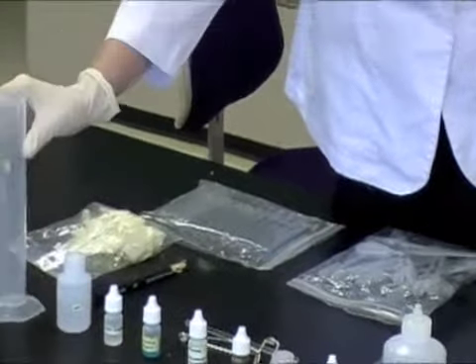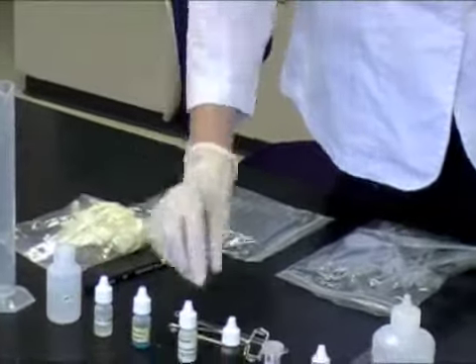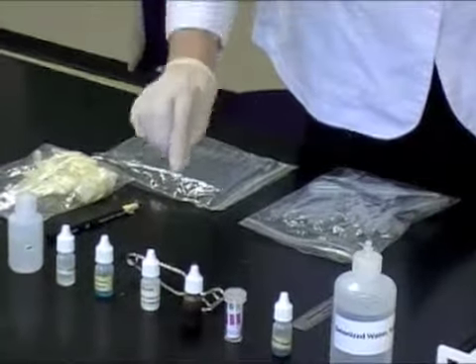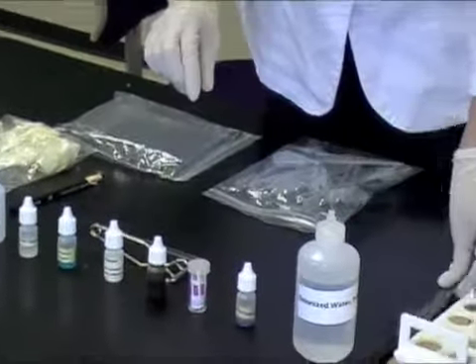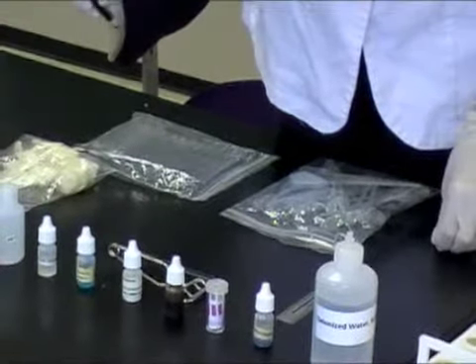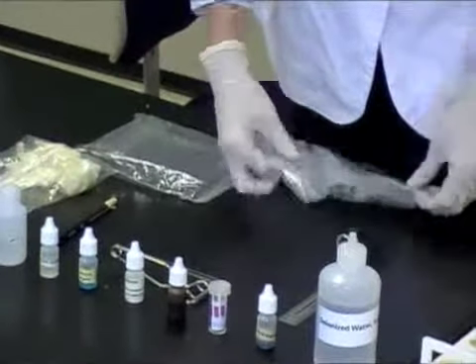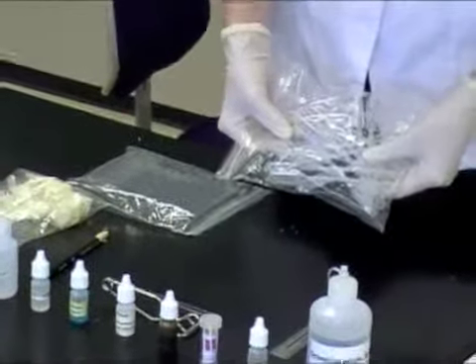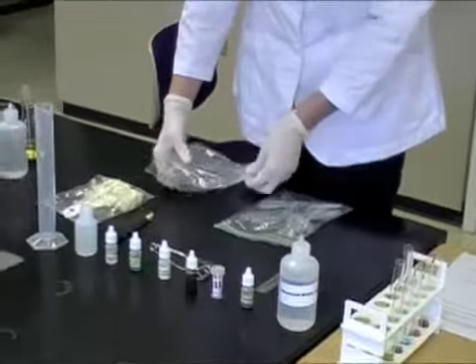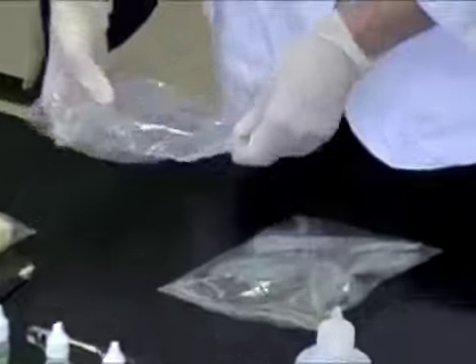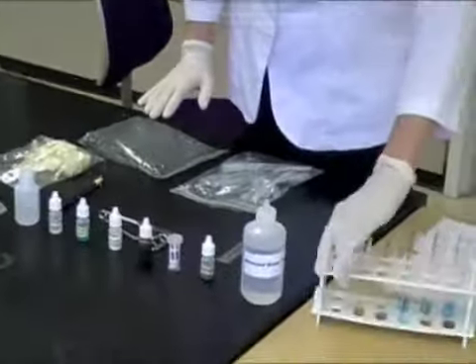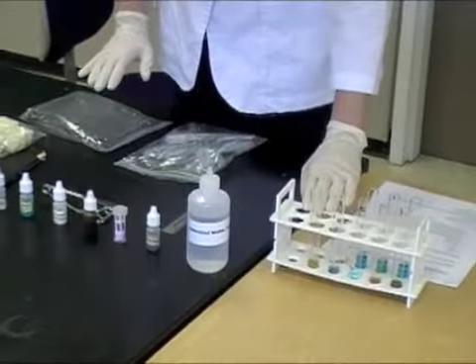You will have a plastic graduated cylinder. You will have test tube clamps, a stirring glass rod. You have a metric ruler, a grease wax pencil to label your test tubes. You will have a baggie full of disposable pipettes. Please use them only once and dispose of them. You will have a baggie full of test tubes that you can rewash and reuse. You will also have a test tube holder, which you will use throughout the experiment.